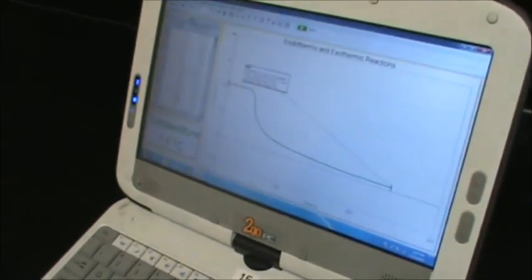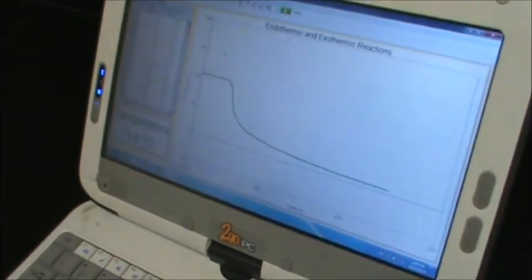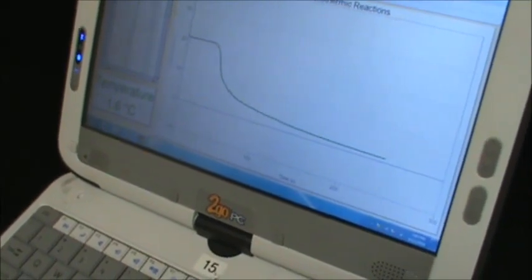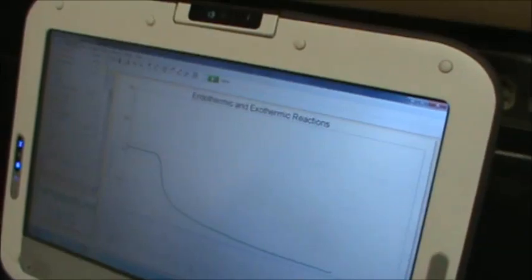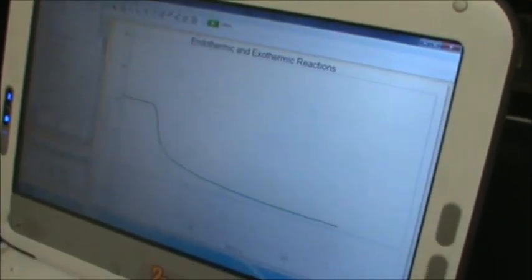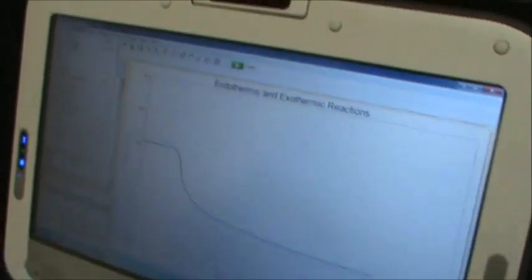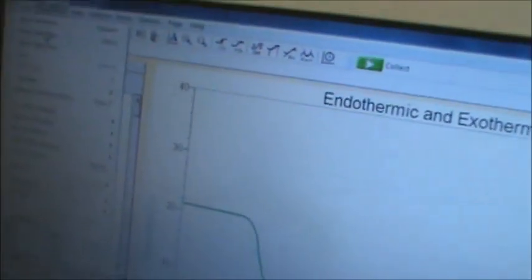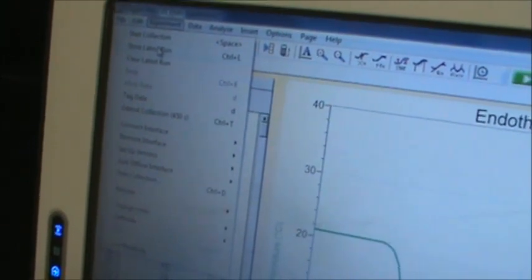We want to store the latest run. Go up to the Experiment menu and click on Store Latest Run. What happens is the line becomes very fine and it's stored. If you do not do that, you'll lose your data when you do the next run.